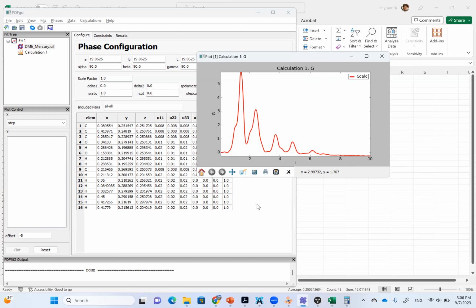And if we want to do PDFGUI for PDF calculation for polymers, we can still first follow three steps. Structure optimization, we need to get a structure, better ending with the PDB, Protein Data Bank format, right? So there are several ways. I think ChemDraw can produce the PDB, right? ChemDraw, yeah. So ChemDraw is also one option. ChemDraw can also give the PDB data.